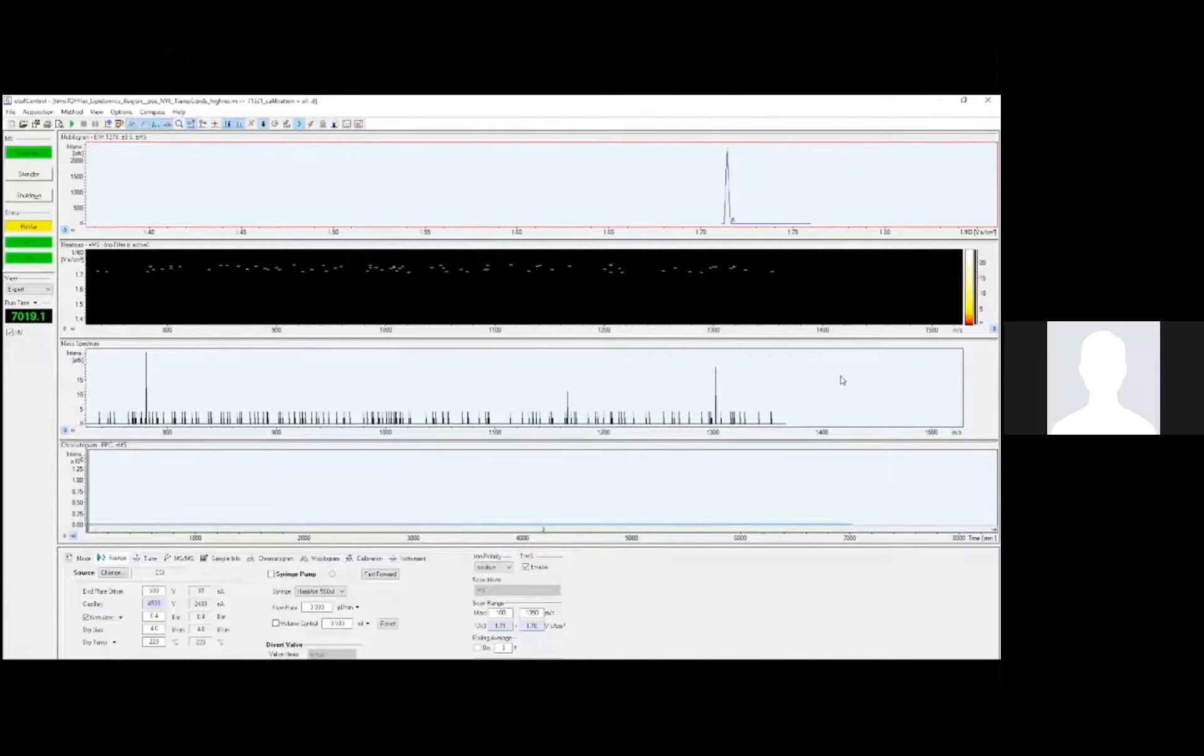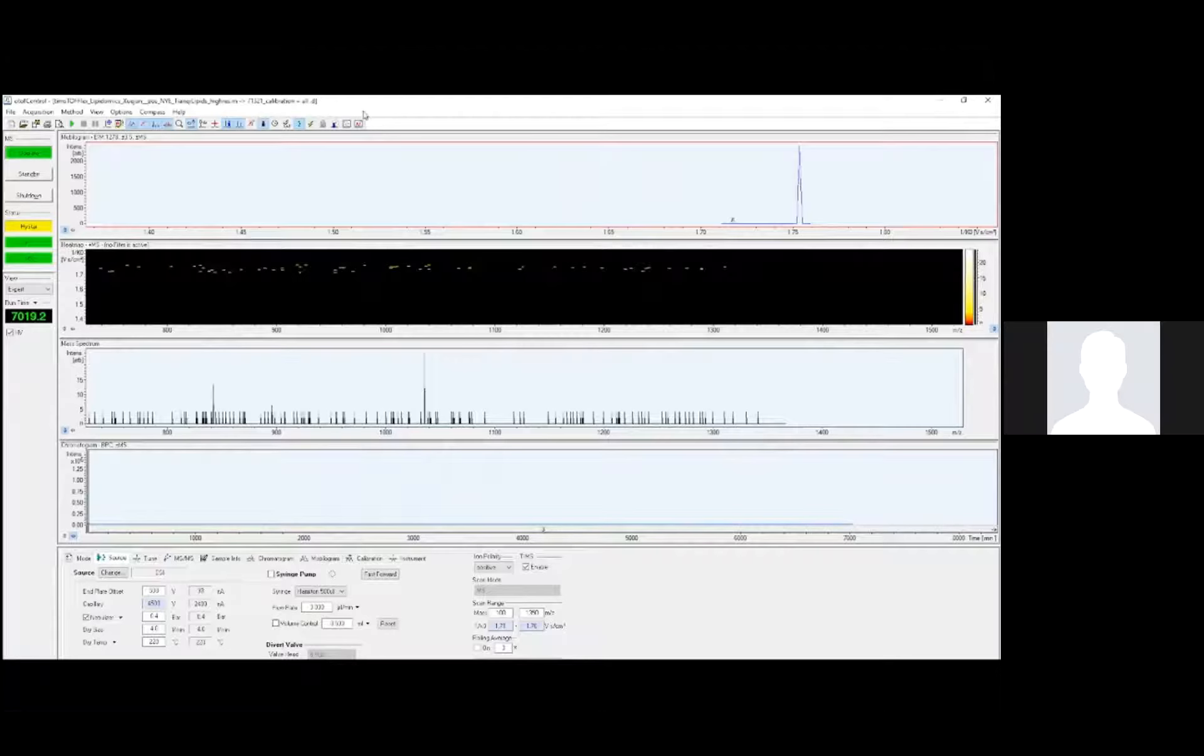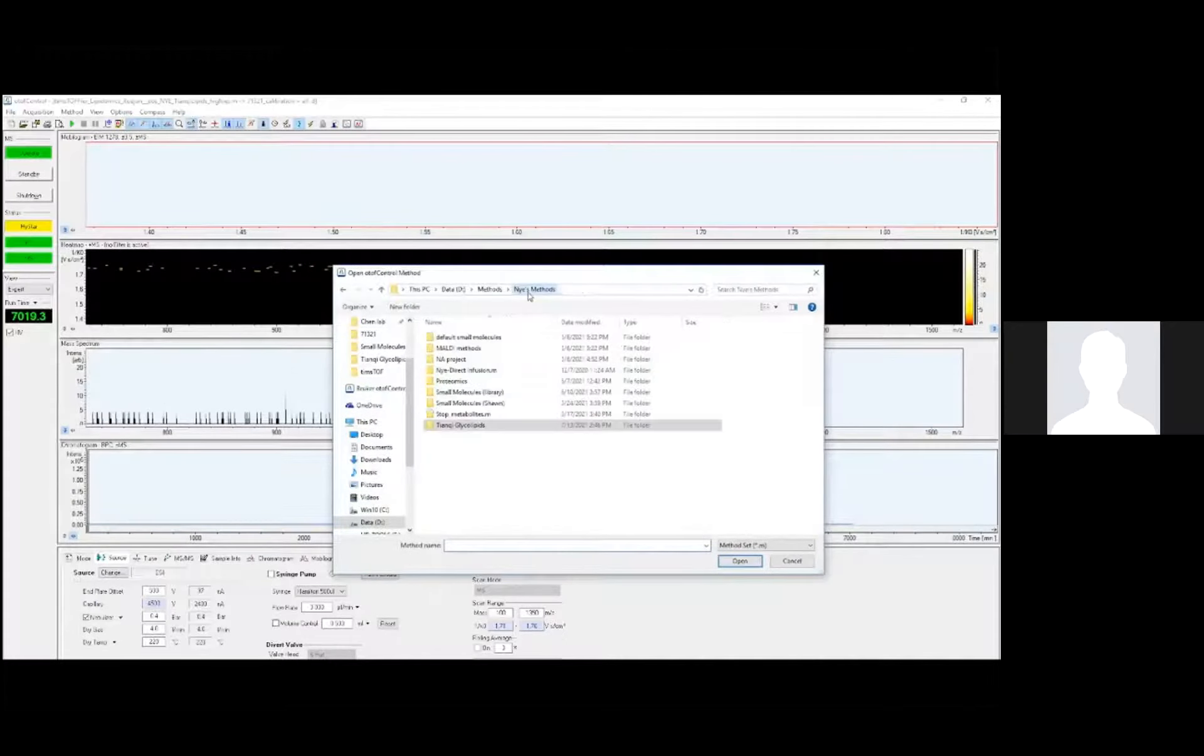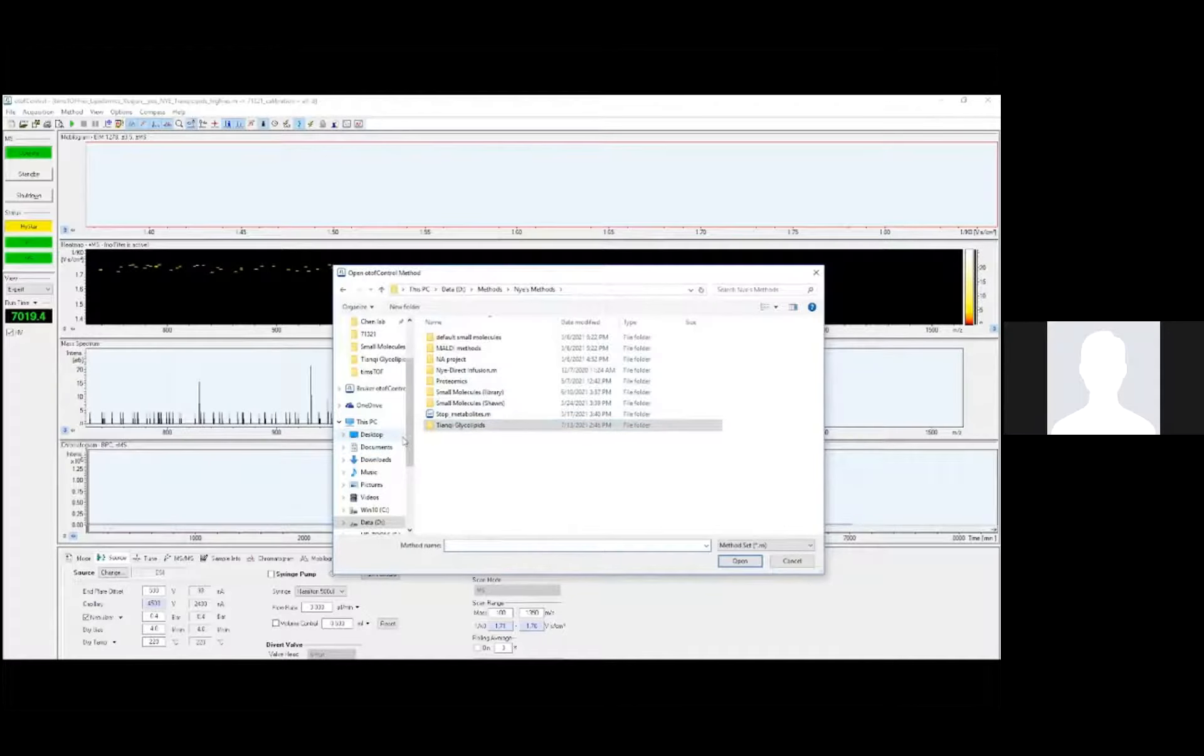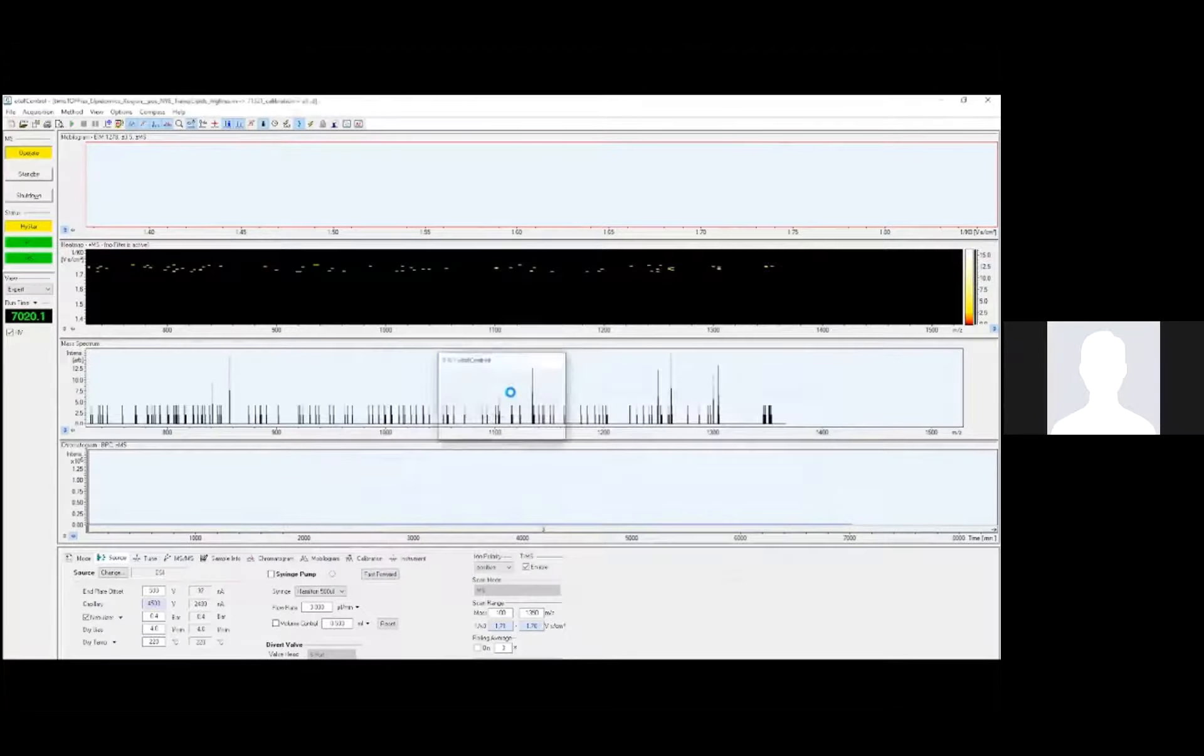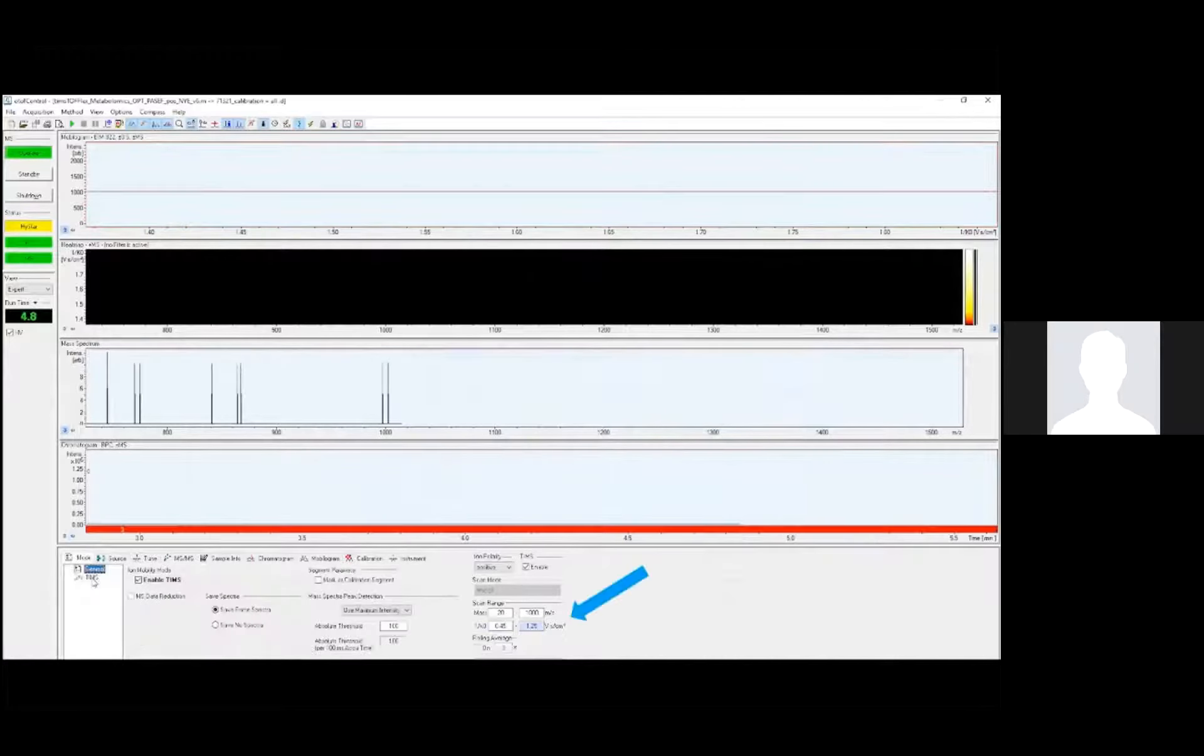Now that the instrument is set up, I can open an appropriate MS method using the OTOF control software. I'll show you the tuning parameters that were set for this method, and also I'll show you the calibration steps. Whenever you get a mass spec, the manufacturer will generally provide you with a default method that works well for a given application, such as small molecules, proteomics, or lipidomics.